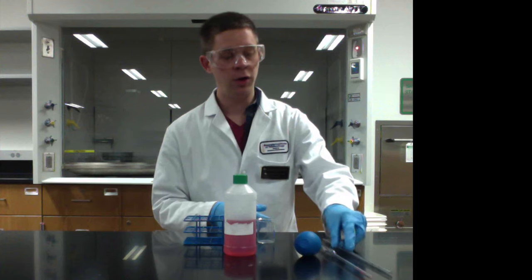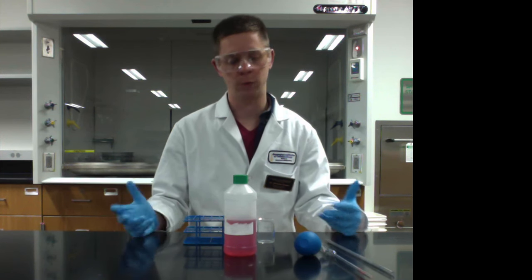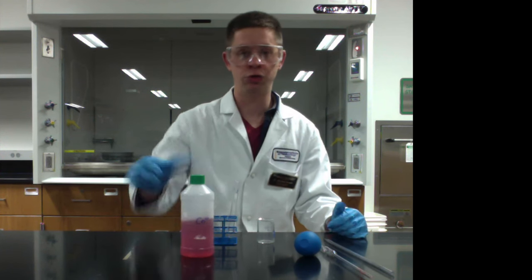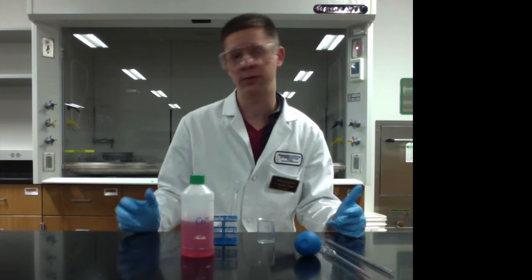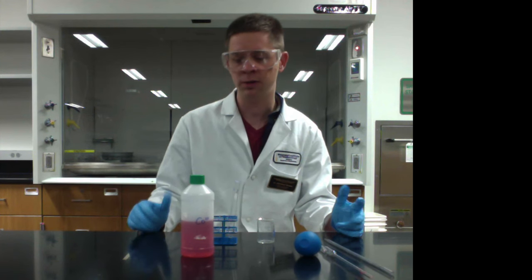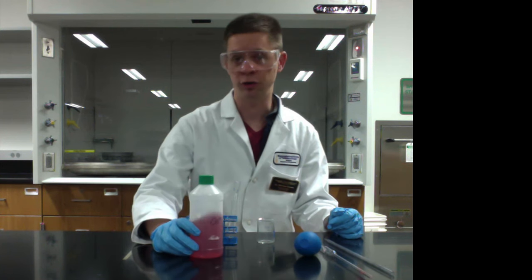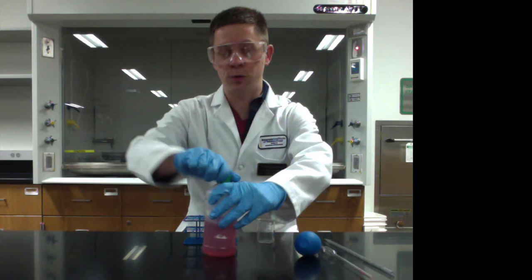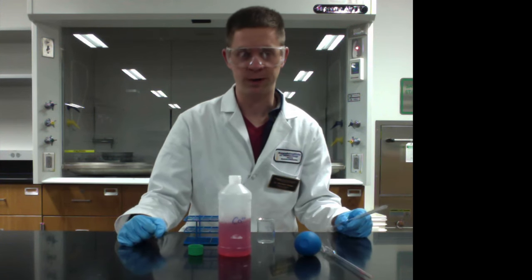Now, you know you need some volume of liquid to accomplish something in the laboratory. Where do you go from there? Well, what you're going to have in the laboratory is solution more than likely in a reagent bottle. You may prepare the solution yourself in something like a volumetric flask, but typically it'll have been prepared already in a reagent bottle. It is very important not to dip a pipette directly into the reagent bottle.